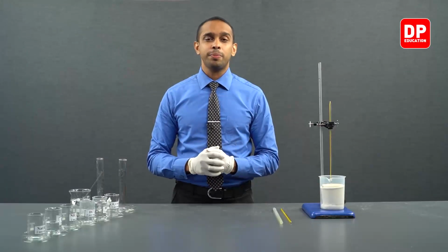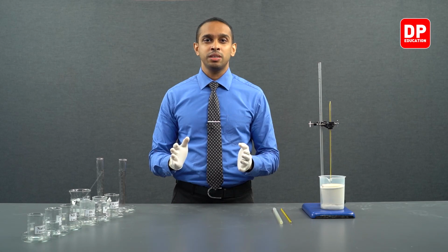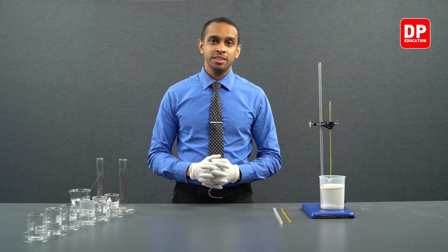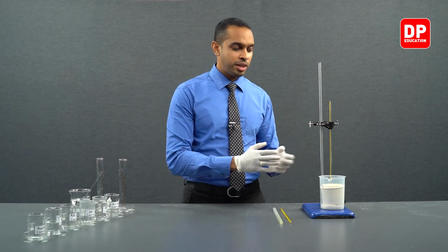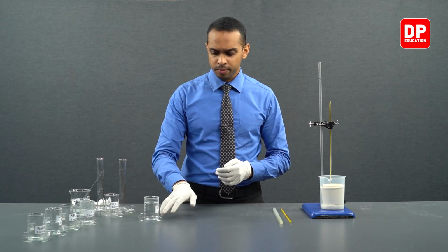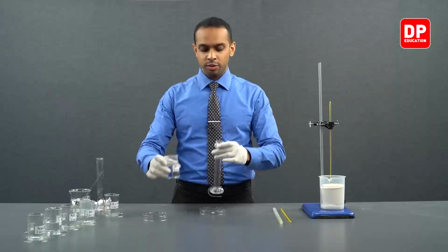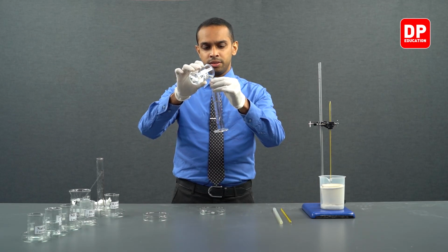In the second part of our practical, we are going to be looking into a reaction between potassium hydroxide and nitric acid. Now, let's first measure 50 milliliters of nitric acid and transfer into our plastic container here. We have our nitric acid over here. We are going to take a measuring cylinder and measure 50 milliliters of nitric acid.